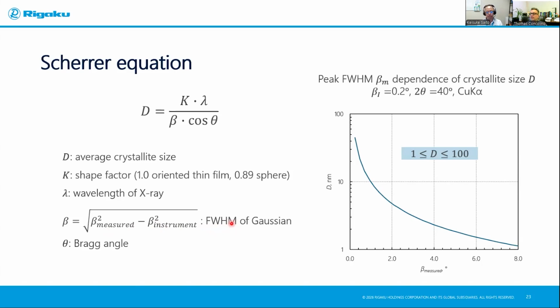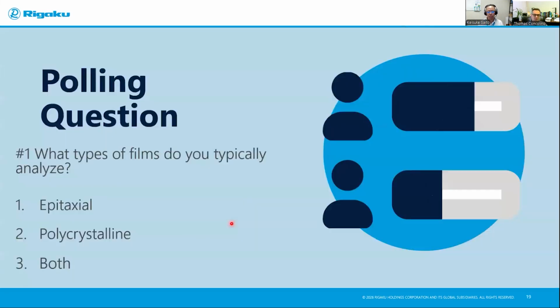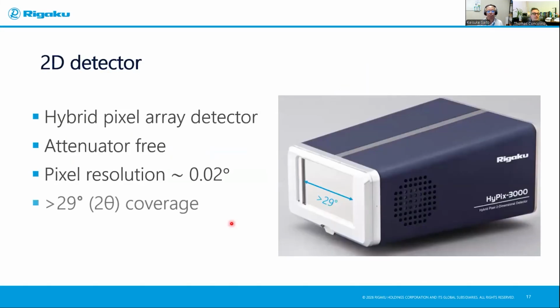Okay. All right. And then we had a couple of questions about the 2D detectors. One is, does the pixel resolution mean that you can't confidently differentiate peaks at, say, x of 0 and x of 0.01 or 0.001, essentially? So can you truly differentiate the two theta angles?